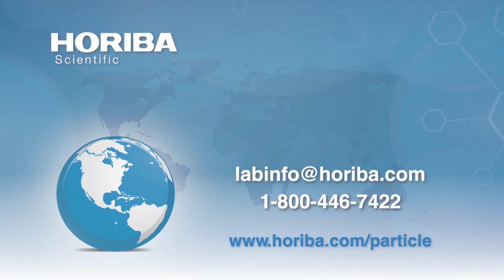Okay, so for multi-particulate processes and how your excipients impact the process, so they're asking, I guess, about the CQAs and your support. That's probably the Chuck question. Sure. Thanks, Jeff. So I think we covered critical quality attributes, certainly of the substrate. So in the presentation, I believe early on, we talked about particle size distribution, friability, and sphericity. Those would be my top critical quality attributes for a multi-particulate, and specifically the substrate.